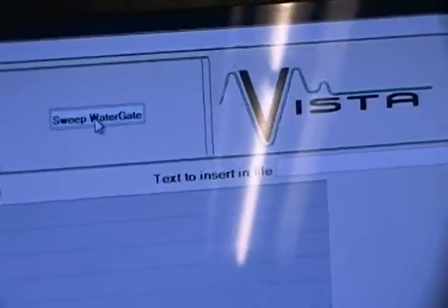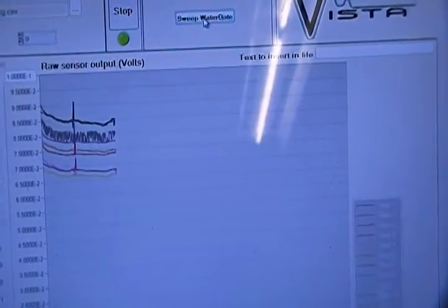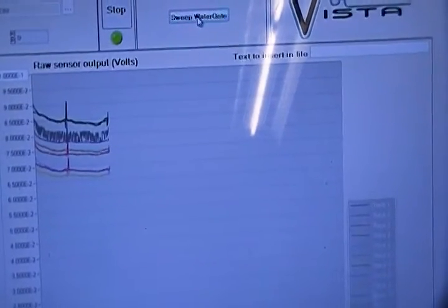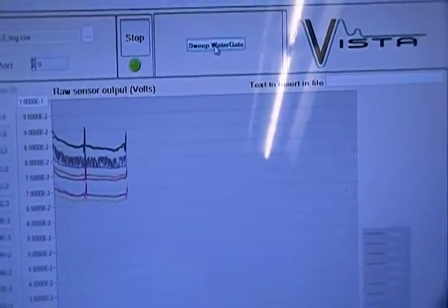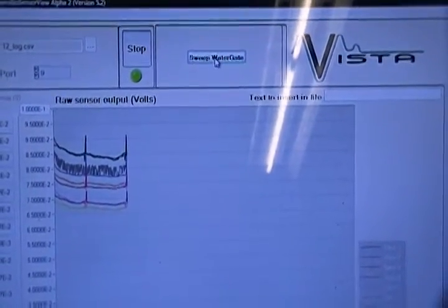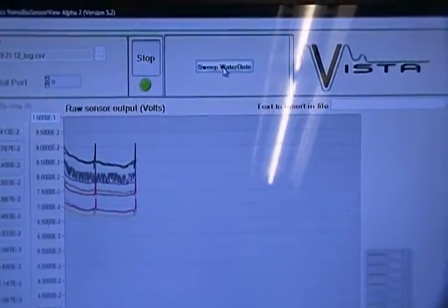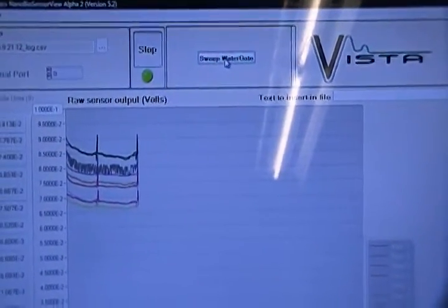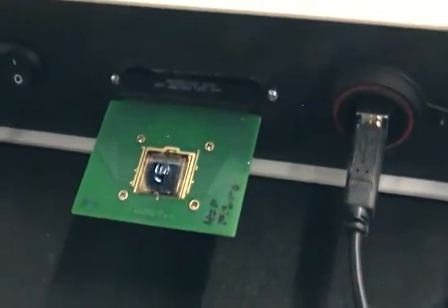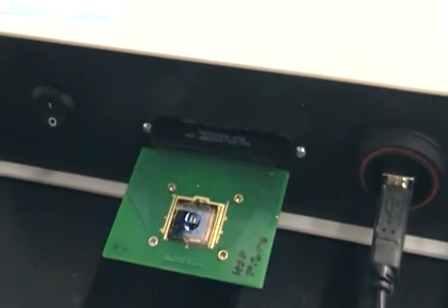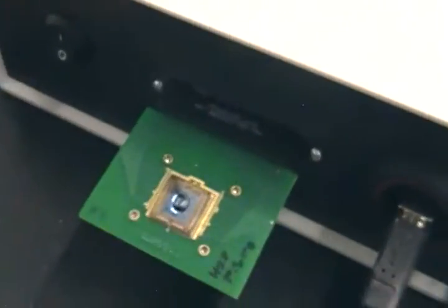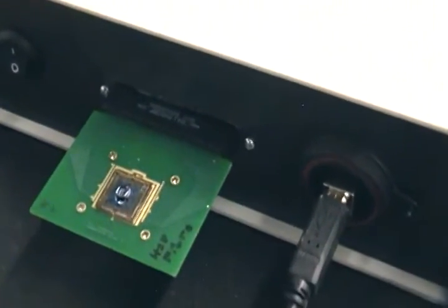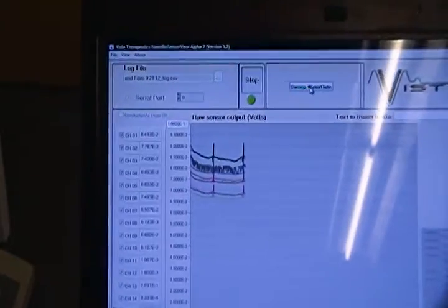We turn on the voltage sweep, and it runs negative 100 millivolts, and then positive 100 millivolts through each wire. And then we can normalize to how much that nanowire changes as a function of a known voltage, and that allows us to compare one nanowire to the next. This is very important to keep in mind that this particular chip has been dried and rehydrated and dried and rehydrated several times. And I can pull up a data point if you'd like in a moment, but I'll put this more in a report. We'll probably publish this, that they do not lose their sensitivity over time.